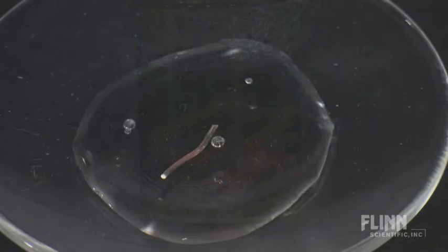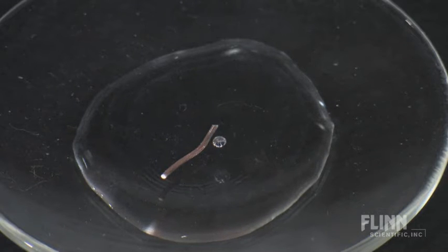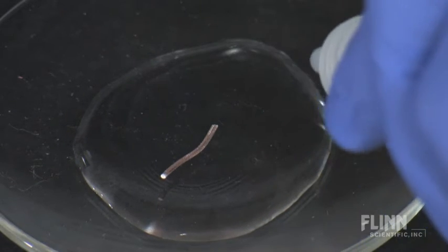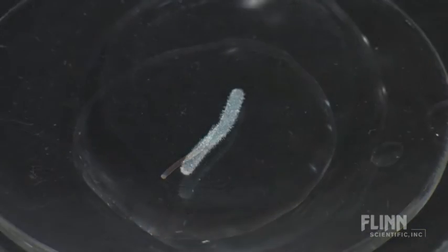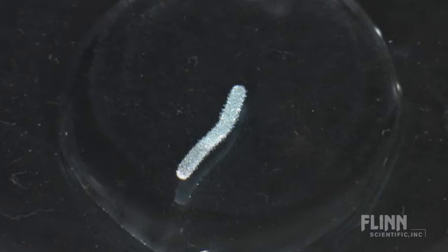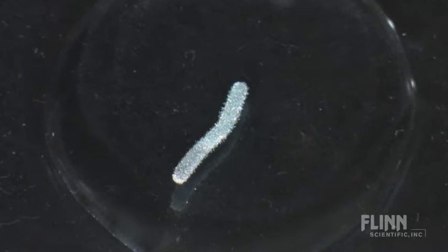You can also view the progress of this reaction under a microscope. Cut a small sliver of copper foil or copper wire and place it on a microscope slide. Add a few drops of 0.1 molar silver nitrate and watch the delicate crystals of silver grow in tree-like fashion on the piece of copper.